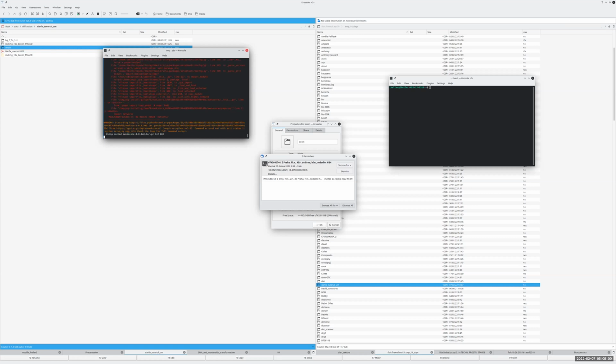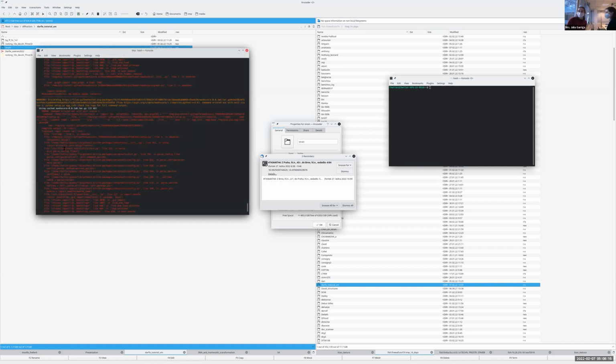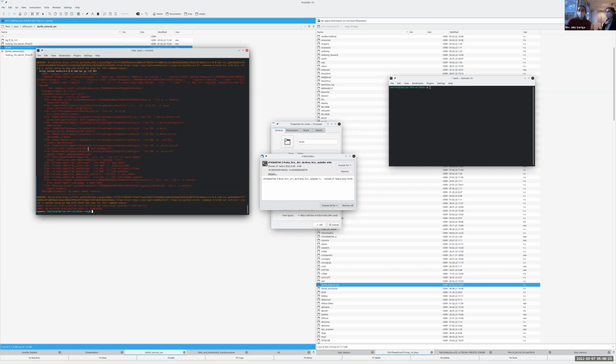It's strangely stubborn. It doesn't like it. It's probably the issue with those errors now. I tried to go into detail, but I didn't figure out what the issue is. The workers are on strike, so if you can try to open it, see if now you have a version you can work with. Maybe it's because of that. Probably it's because of that.